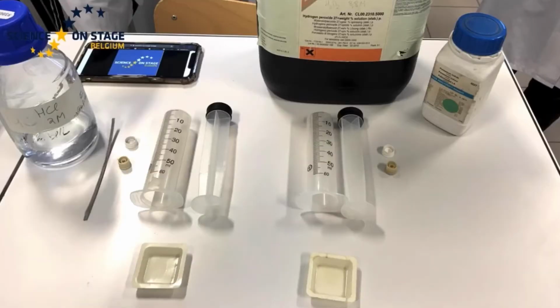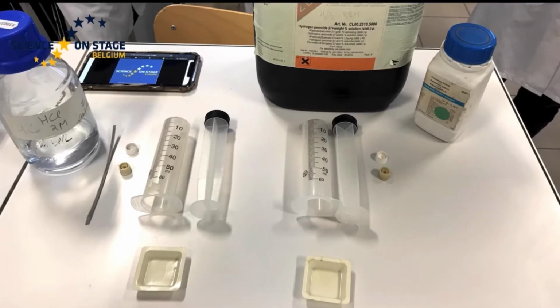On this photo, you see all the materials needed for each group of 2 students. The chemistry reactives are HCl 2 molar solution, magnesium tape, hydrogen peroxide in solution also. We make a dilution with this stock solution, and potassium iodide. And then you need 2 syringes with a stopper, beige stopper, and a small white cup that fits in the syringe, and a cup to put the liquid, 10 milliliters of liquid is okay.